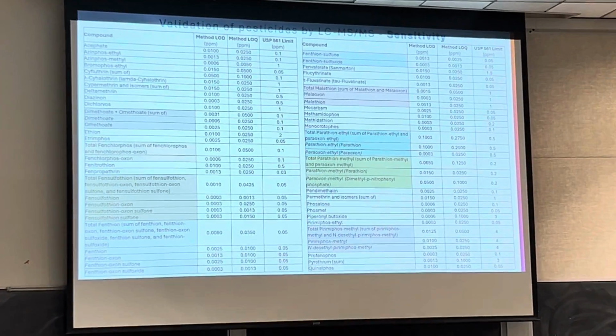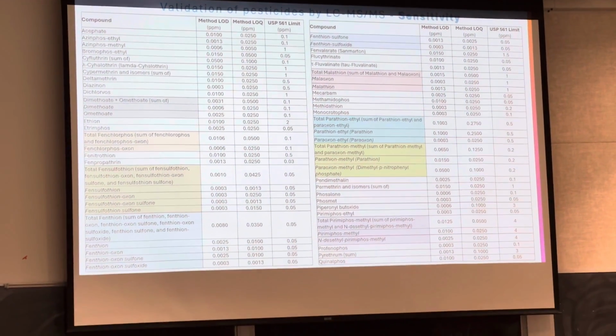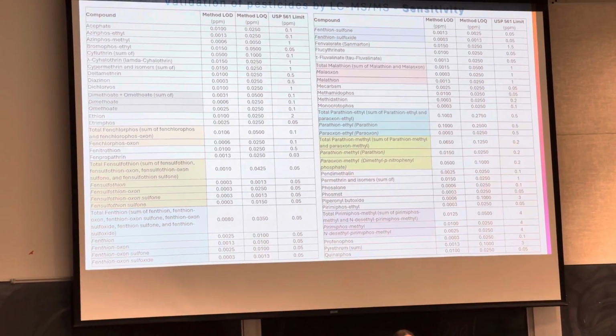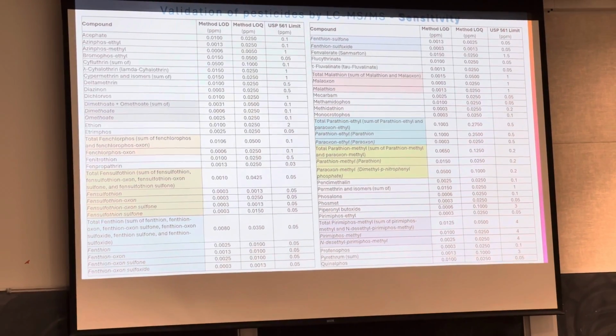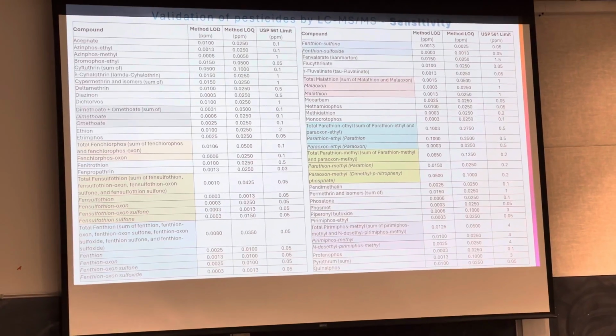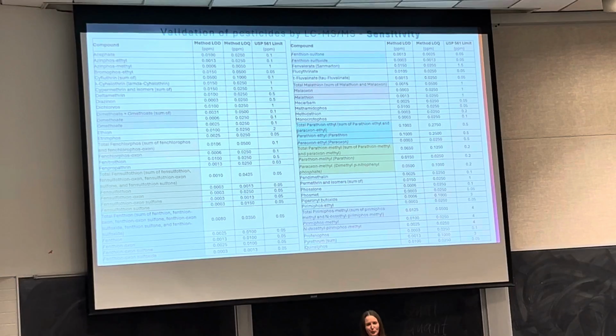The LCMS method that we developed provided an LOQ of each compound at or lower than the acceptable limit per USP 561, and this indicates that method sensitivity is acceptable for pesticide analysis. No pesticides were detected in our 7 representative matrices.